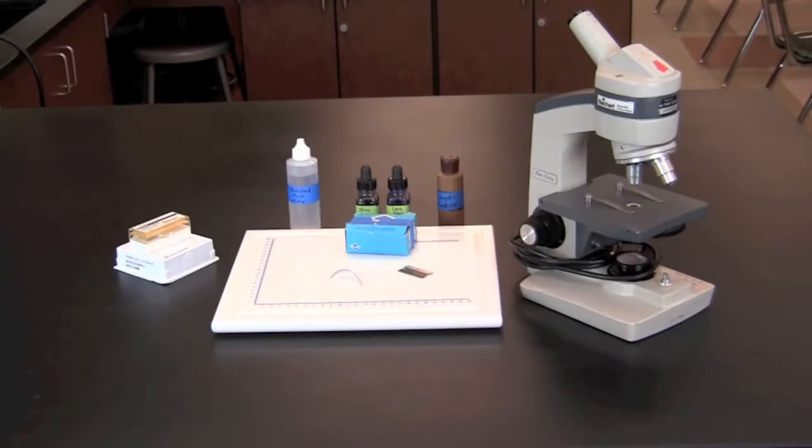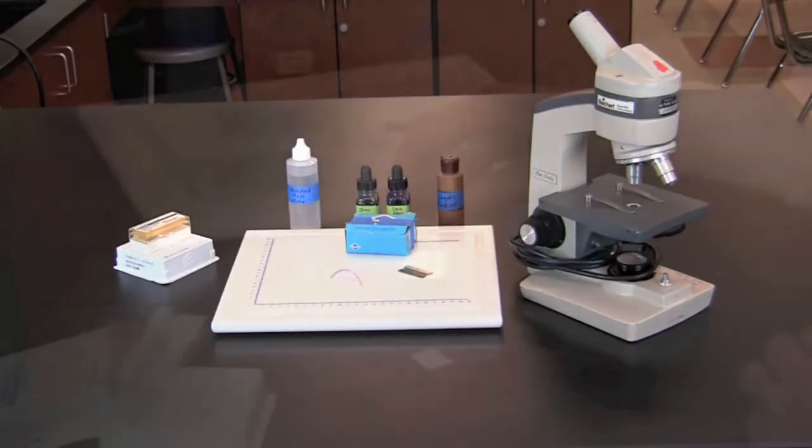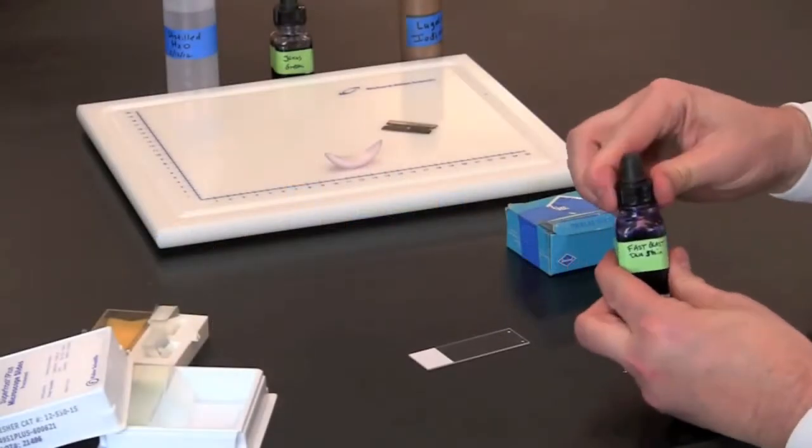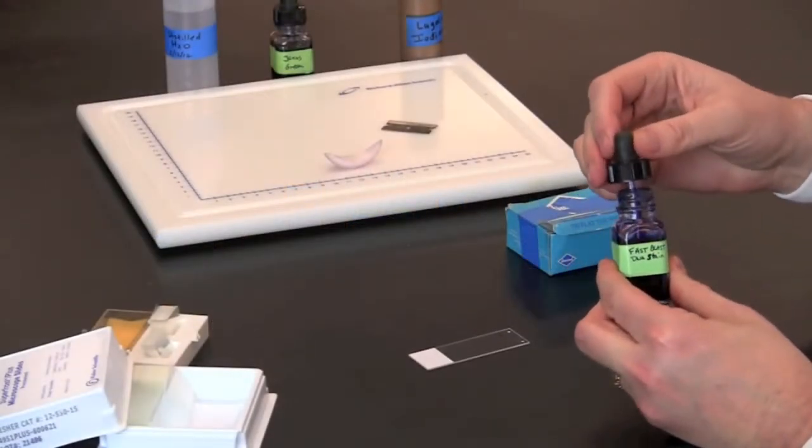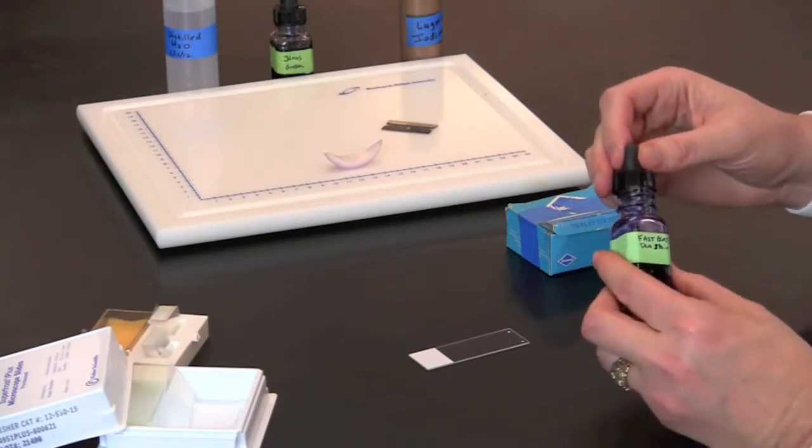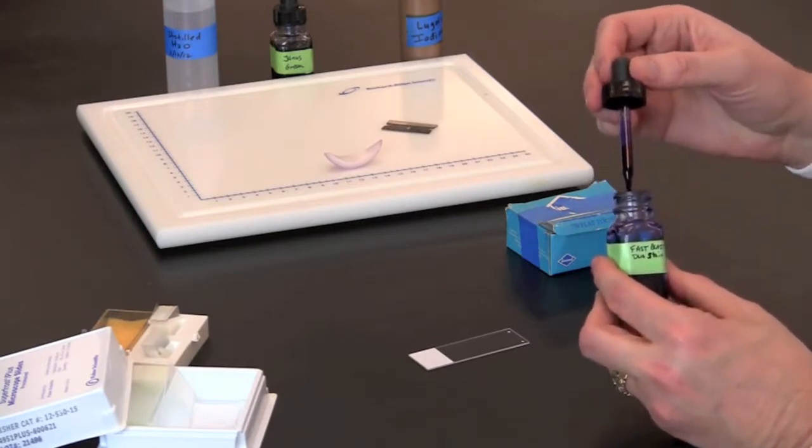In this video you will learn how to stain eukaryotic cells. To make a wet mount of cheek cells, place a drop of fast blast DNA stain on a microscope slide.